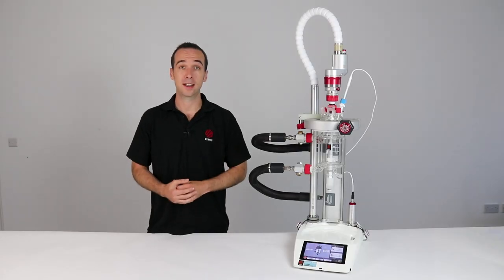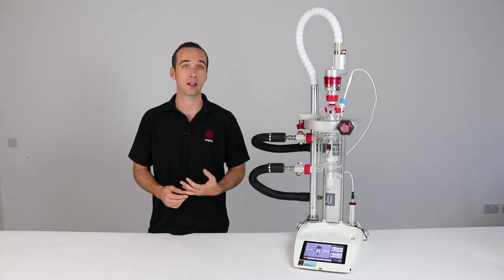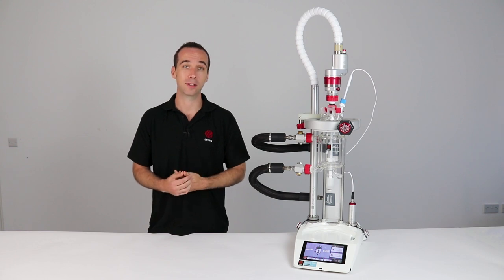The Atlas HD is easy to upgrade for a range of applications including calorimetry, crystallization, high pressure work, parallel chemistry and nanoparticle synthesis.